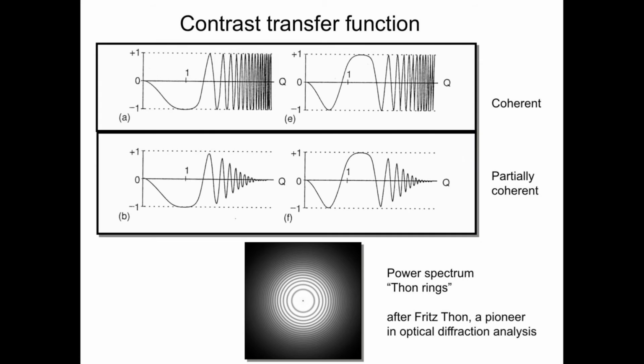One is generated by the defocus, goes with k square. The other one by spherical aberration goes with the k to the fourth. They counteract each other, and then there is an area where they cancel each other pretty nicely, and they create a region of constant sign.